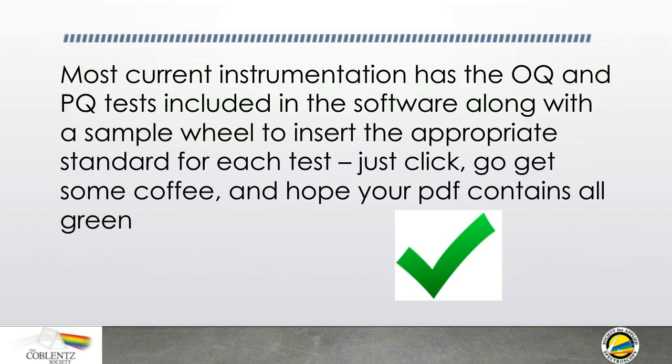So most instruments have the OQ and PQ built into them. And as one of my co-instructors in the live course would say, you click the button, you go get some coffee, and you come back and the PDF is either on the screen or on the printer. And we can thank the instrument vendors for this, because before this was started to be built into the instruments, this was something that you had to do manually.